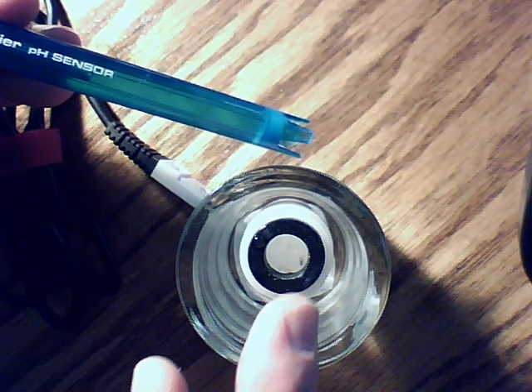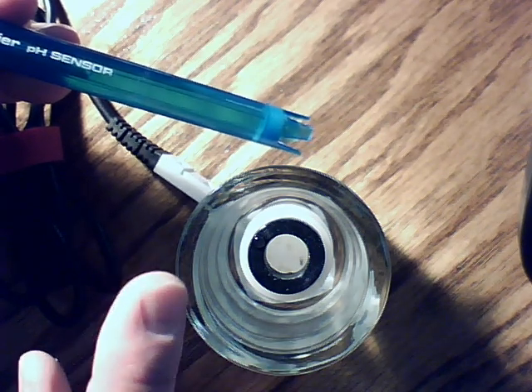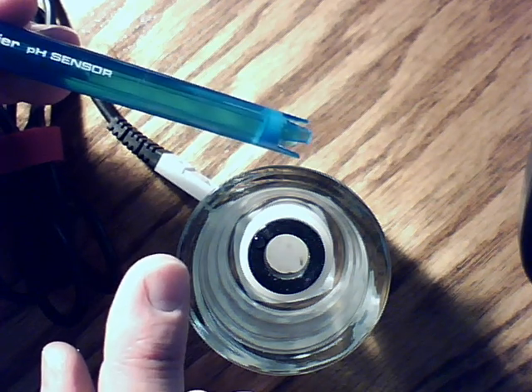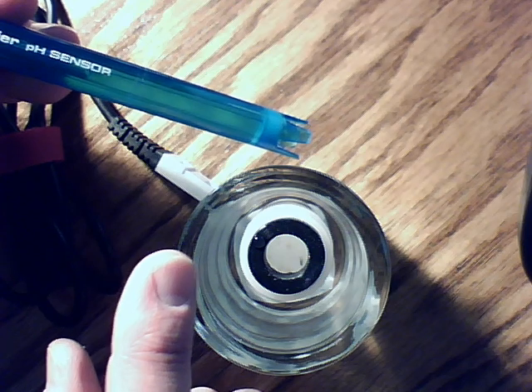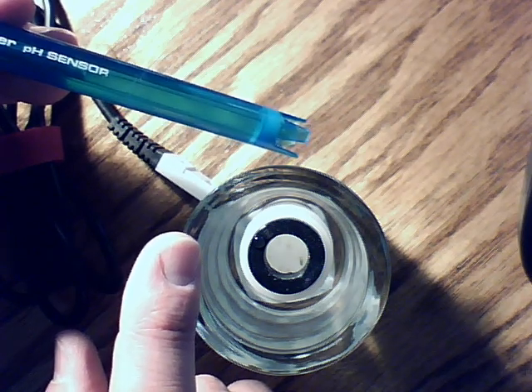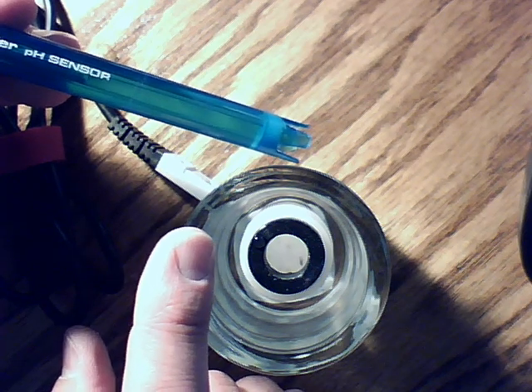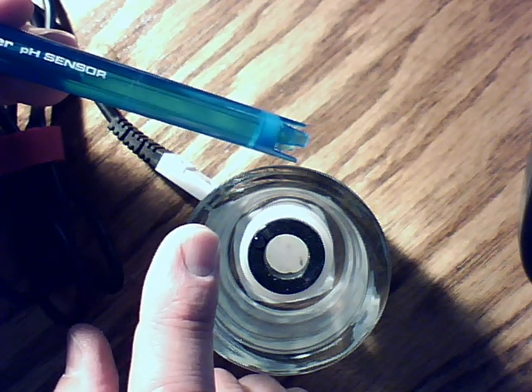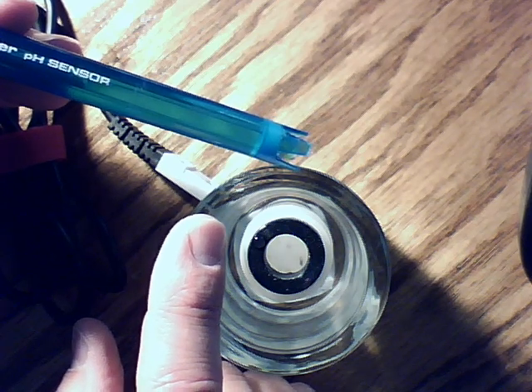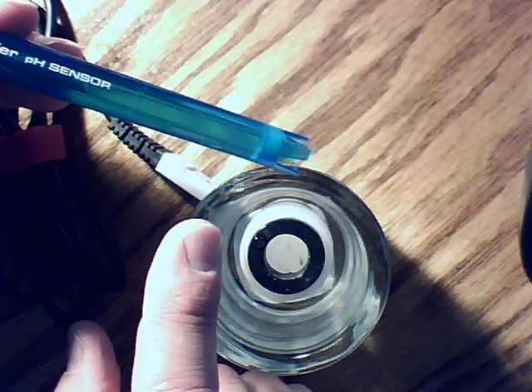If you go from an acid to a base, rinse it off very well. You have rinse bottles. The rinse bottles that are marked 'water' are the only ones you use to rinse it. Distilled water goes in the rinse bottle — most of you have one with a blue top, that's the one with distilled water. Only put distilled water in that rinse bottle and only use that water for rinsing this tip.